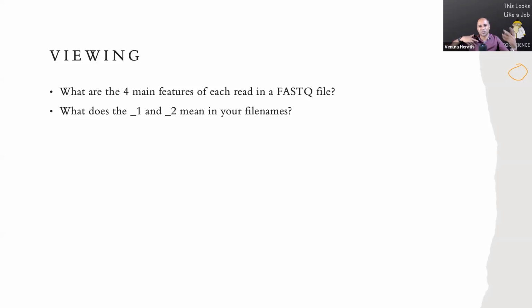It's basically optional following a name. And then the last row, you have the quality scores, because there we use the ASCII symbols. So each indicates a different level of quality. And I think we discussed it a while back when we were doing our introductory lectures. Okay. So moving forward.